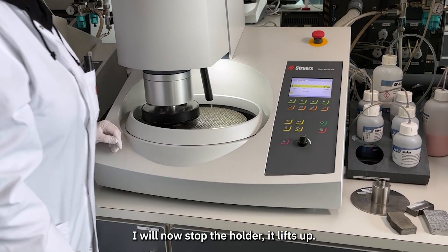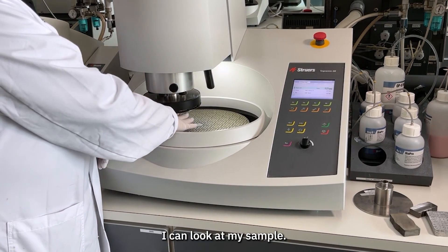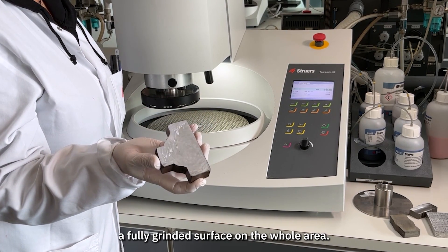I will now stop the holder — it lifts up. I can look at my sample and make sure that I have a fully ground surface on the whole area.